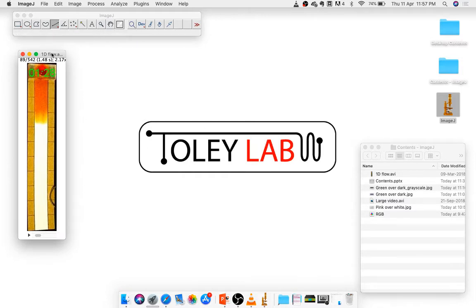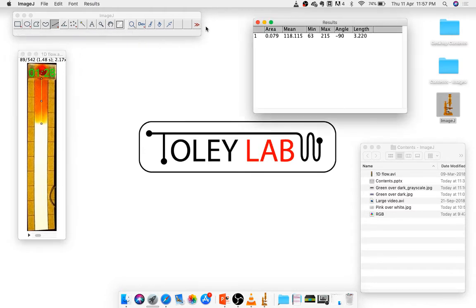Now I can use my line tool again, and I want to know the distance from here to here. And now when I measure it, ImageJ will report it in centimeters. So it's telling me that this distance is 3.2 centimeters. So this is how you can set the scale.